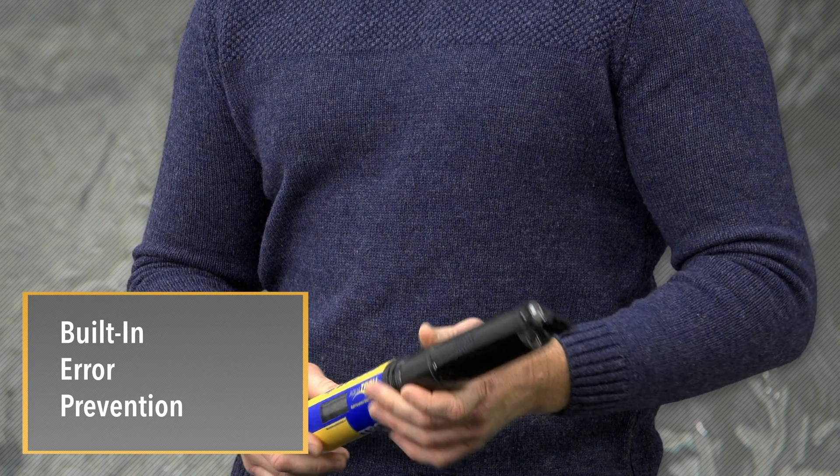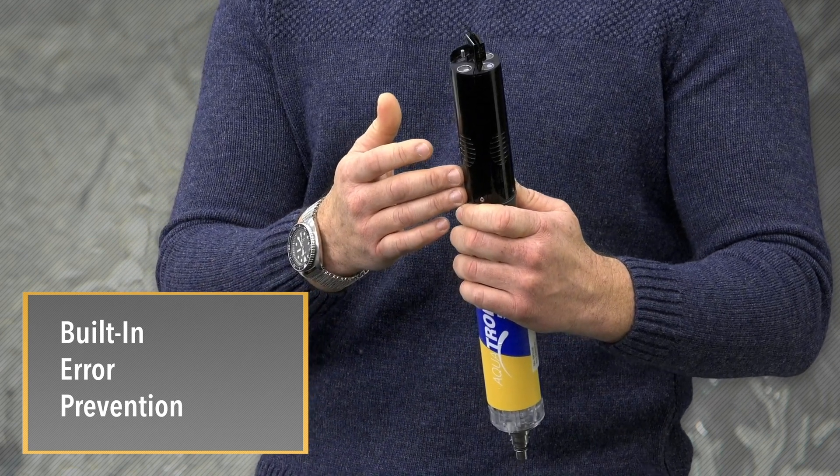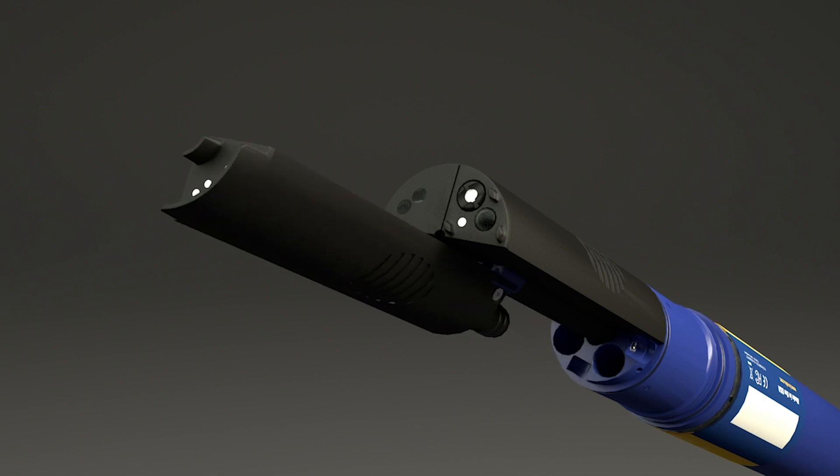Built-in error prevention features a slip clutch on the wiper to prevent accidental damage, and smart sensors that can be put in any port and have wet-matable connectors to reduce corrosion.